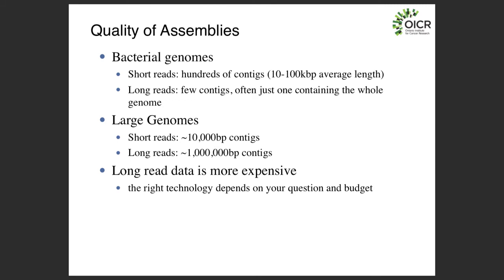You don't have a way to compare yourself. Like, when you do assemblies, you don't have right or wrong within yourself, right? Well, if you do an assembly of a human genome, then you would align it to the reference to do your comparison. If you're doing a complete de novo project and you have no information about it, there is no way to verify that. You can get orthogonal sequencing data. Typically, if you do a PacBio assembly, you'll then get some Illumina data to map to your newly assembled reference to assess how accurate the genome is. But yes, you'd need to use different orthogonal ways to verify that your assembly is correct.